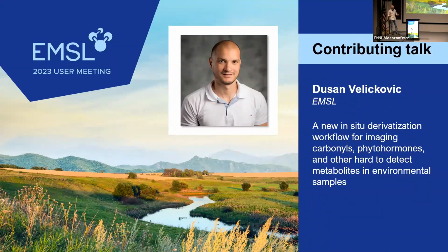So this workflow is designed to image carbonyls, but also phytohormones and other metabolites that are hard to detect by conventional mass spectrometry imaging in environmental samples.